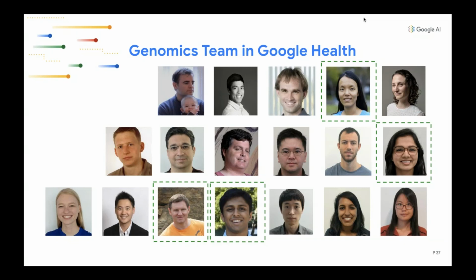Basically, if you go to our GitHub and look at the quick start for PacBio, you'll see that you can put in PACBIO for model type. If that works validly, then you've got the right version.